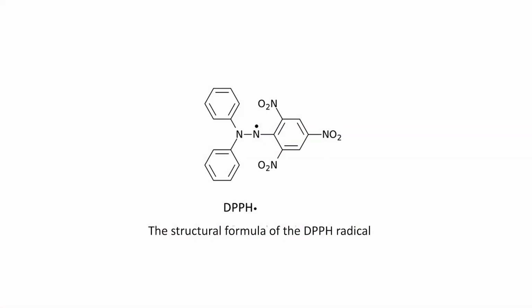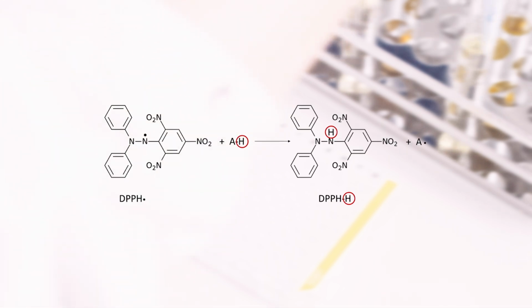In this practical work, you will be introduced to indirect methods, such as the DPPH method. The DPPH method is the most commonly used method for evaluating the radical scavenging activity of natural products. DPPH, 1,1-diphenyl-2-picryl-hydrazine, is a relatively stable radical that serves as an oxidizing substrate and as an indicator molecule for the reaction.